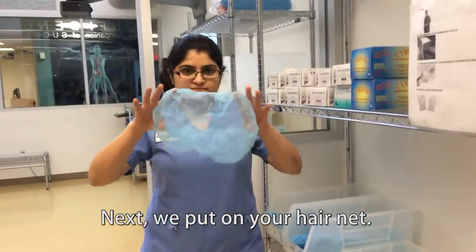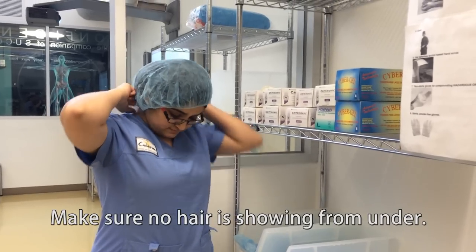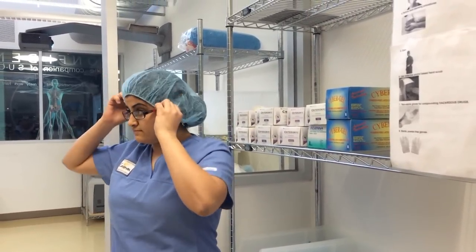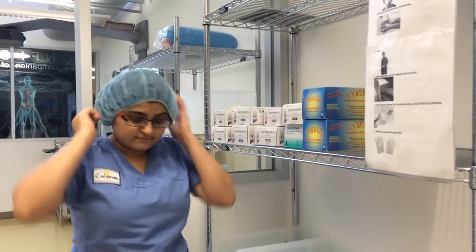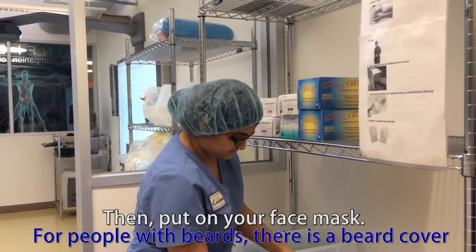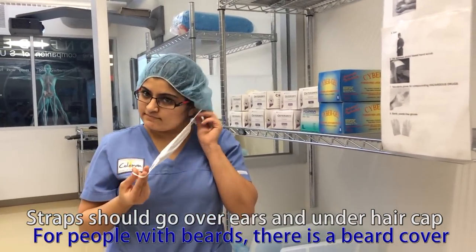we put on your hair net. Make sure no hair is showing from under. Then put on your face mask. Straps should go over ears and under hair cap.